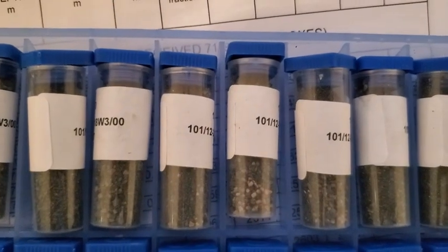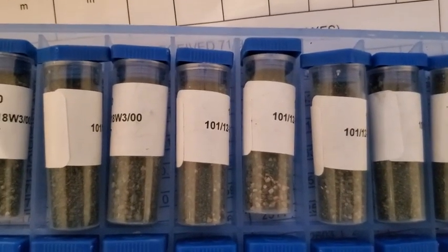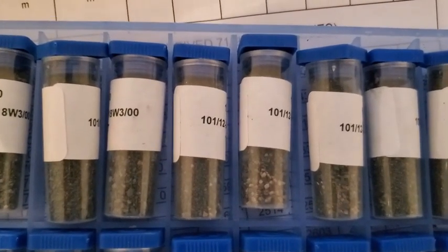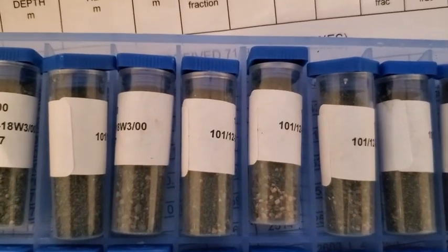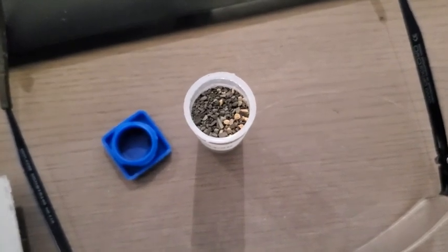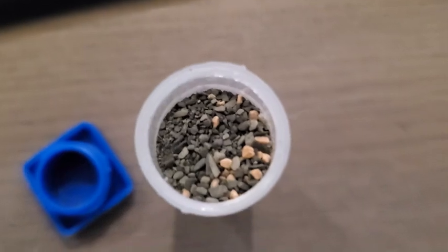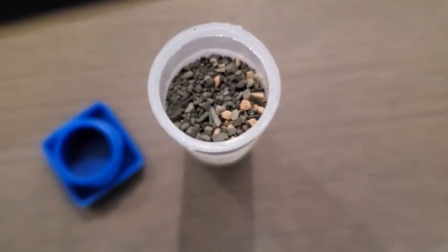And we're looking here at a tray of tubes with drill cuttings inside. You can see the grains, and those we examine under the microscope. So I've opened one of those tubes with drill cuttings in it. You see all these pieces. The pink stuff is lost circulation material.